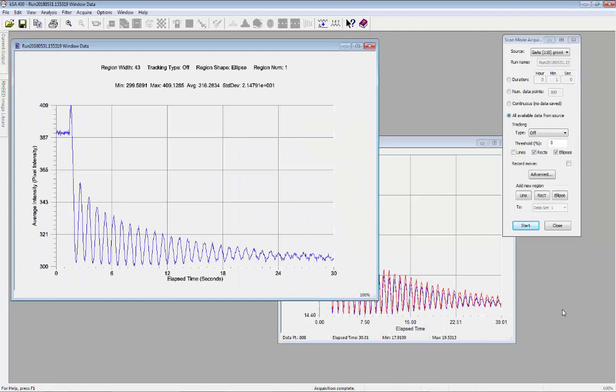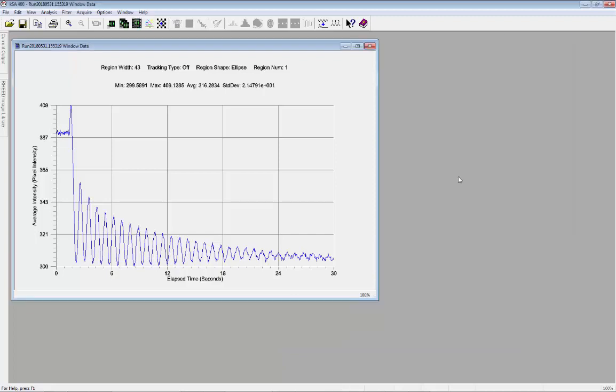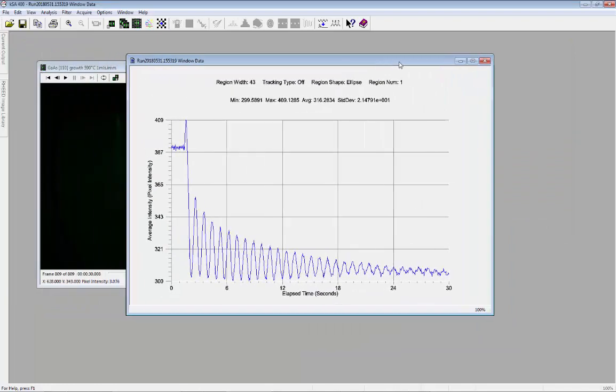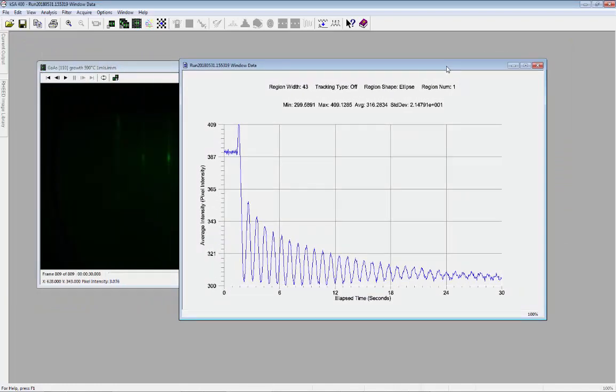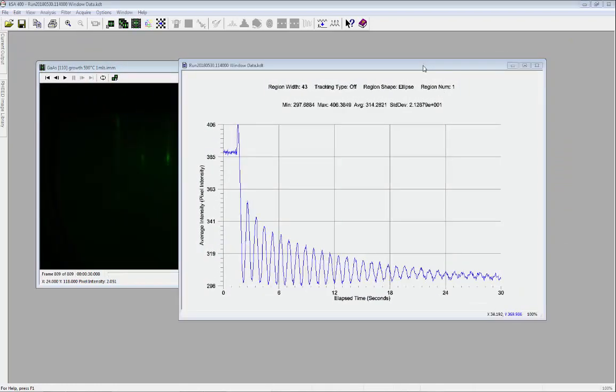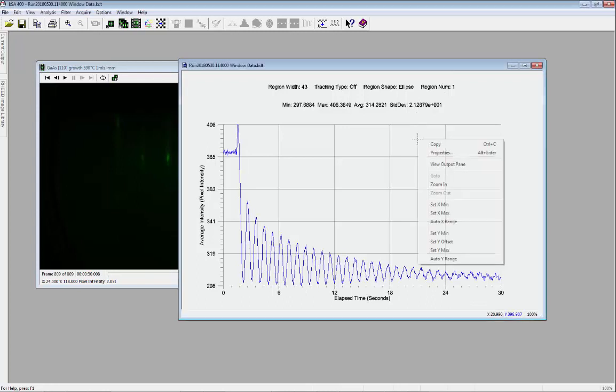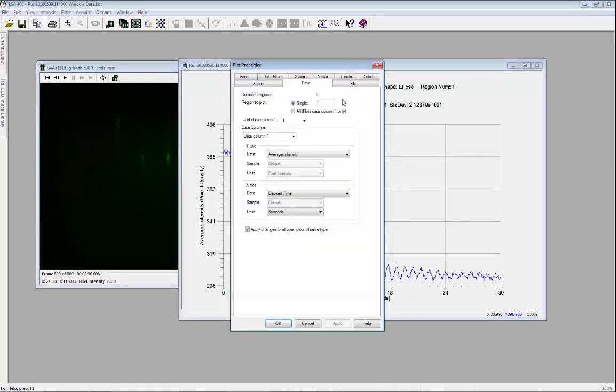When the acquisition is complete, the results will appear in a new window. I can close the Scan Mode acquisition and examine the results. Right-click, select Properties, and then select the Data tab to choose the value to plot.